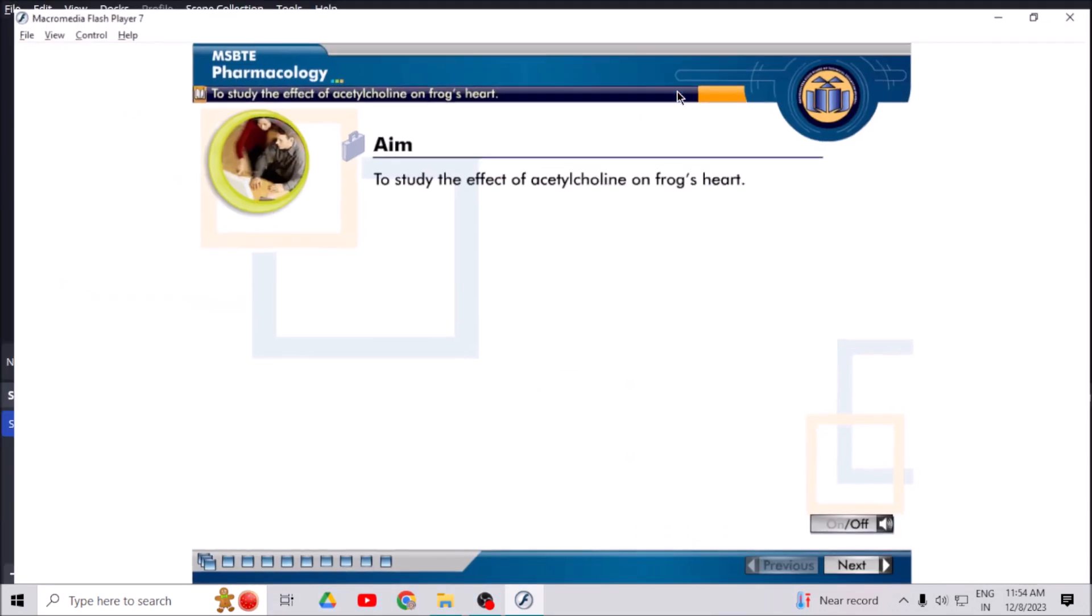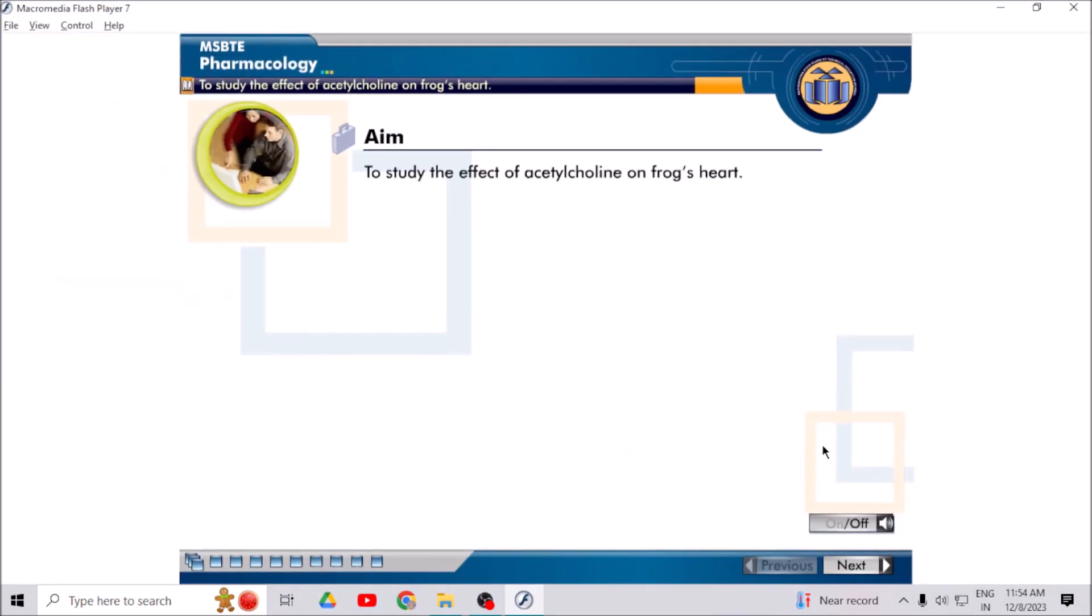The aim of this experiment is to study the effect of acetylcholine on frog's heart.